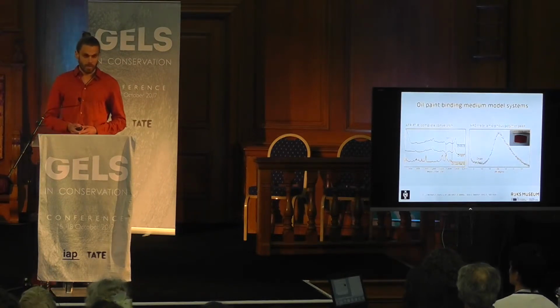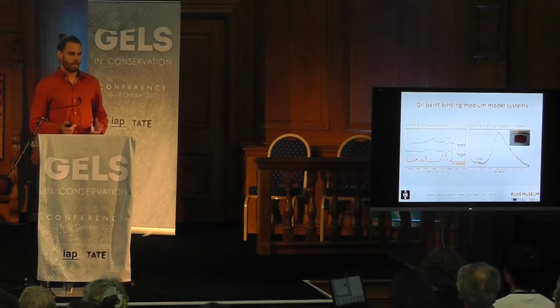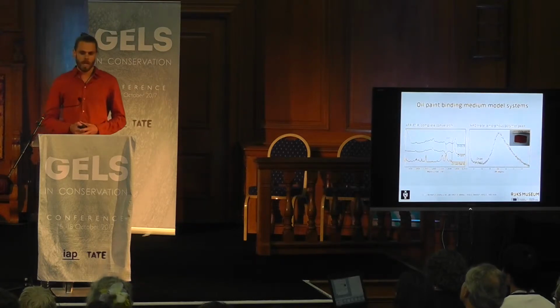In XRD, we see that we have a completely amorphous system, having scattering in all directions, such as a liquid. This is basically what you would also obtain if you would take an XRD spectrum of just linseed oil. So no crystalline material in this system. And this is the model system that we used to test the release of solvents.